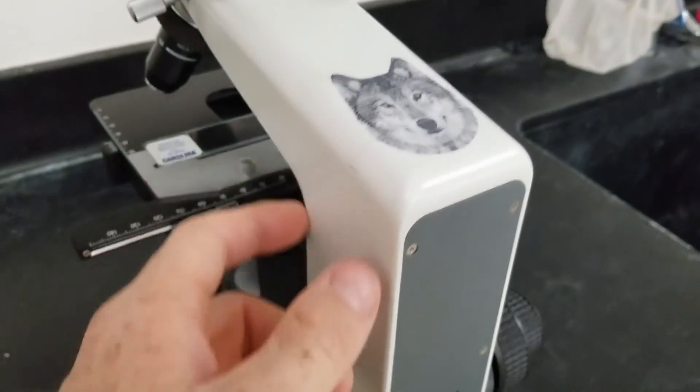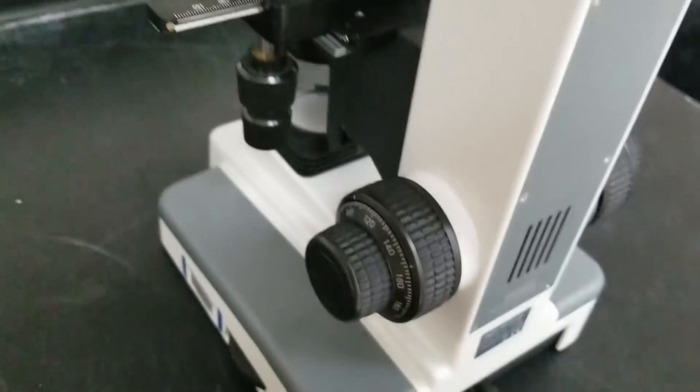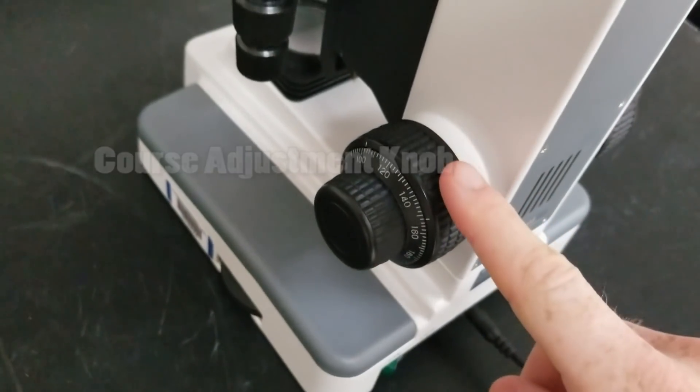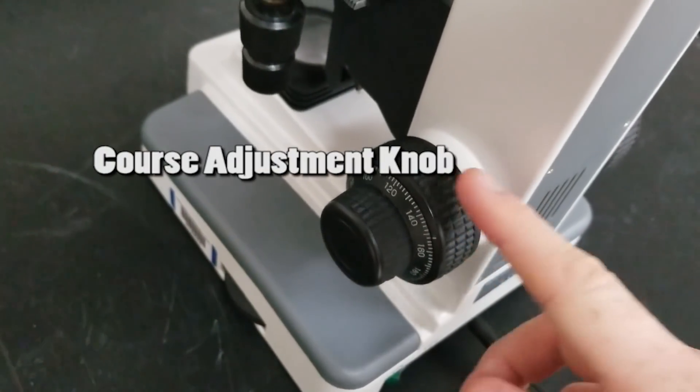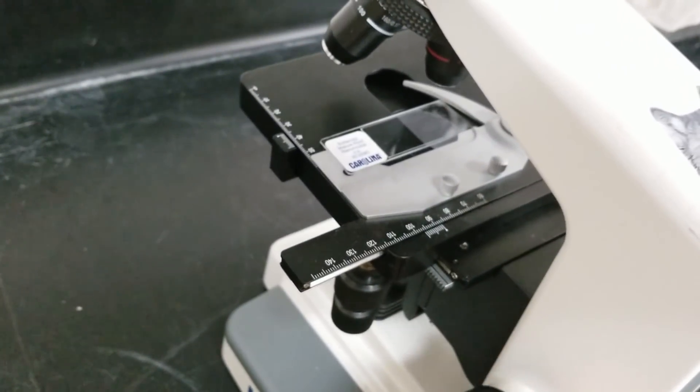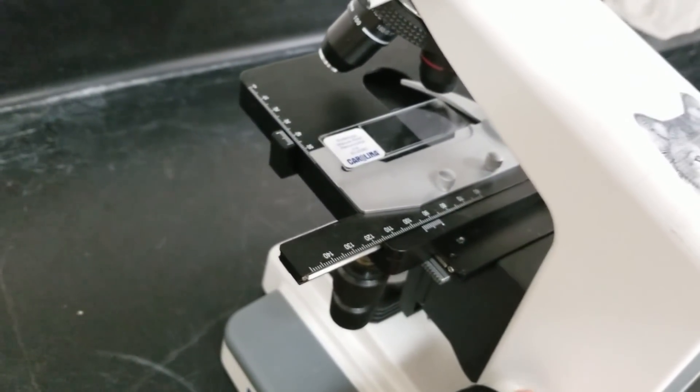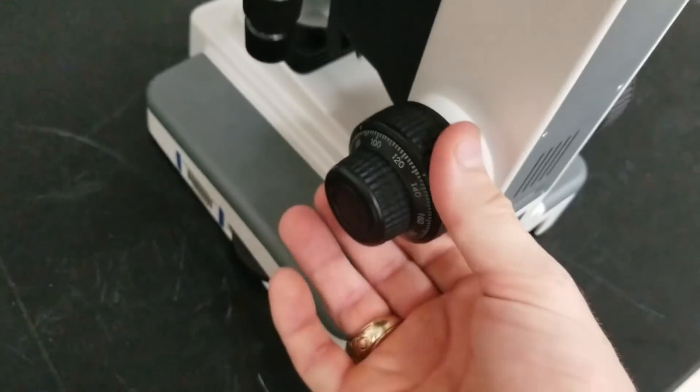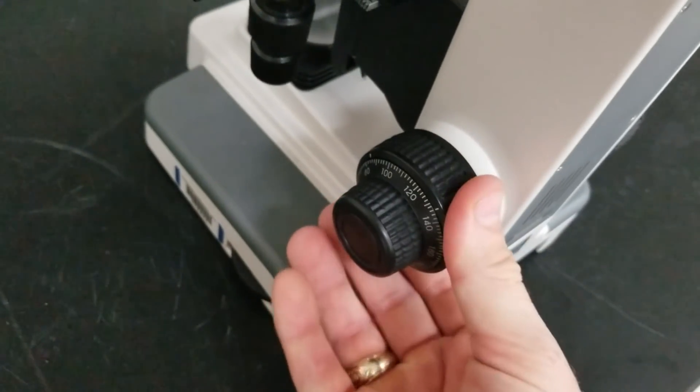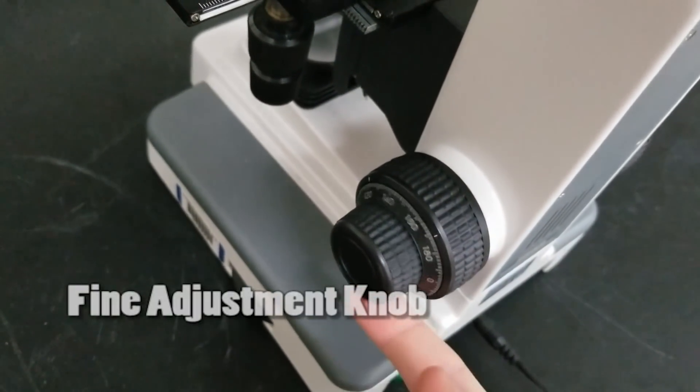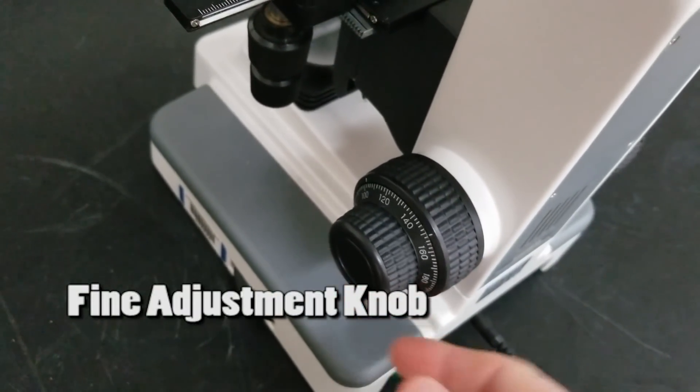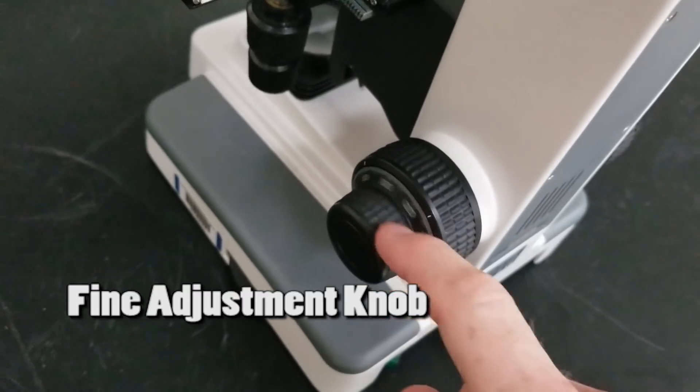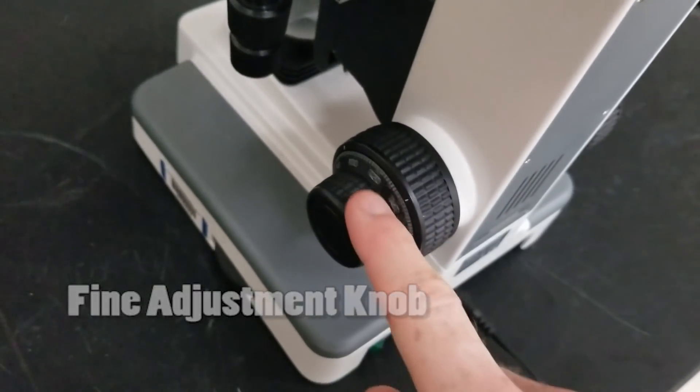Moving down a little bit you have several knobs. This is the coarse adjustment knob. This is going to largely just move this up and down. This is the first thing that you'll use to get the initial adjustment followed by the fine adjustment knob on the outside that looks like a locker combination or a padlock.